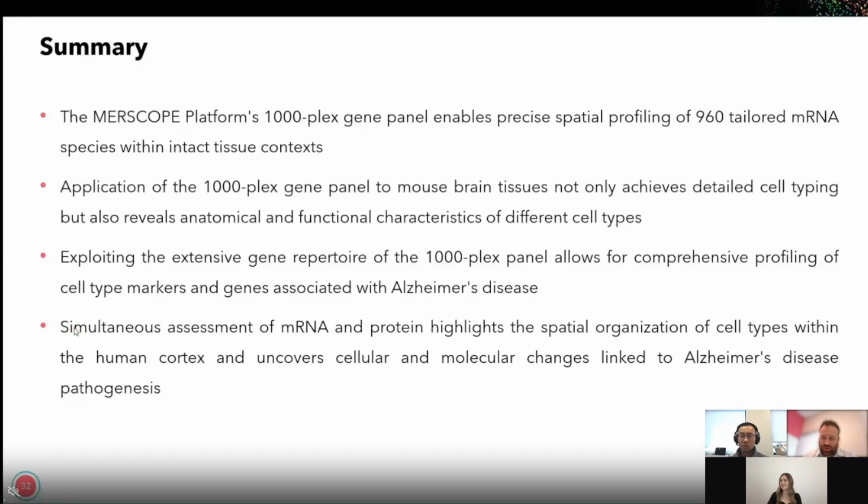Great, thank you, Renchao. And I want to thank our audience for all these great questions coming in here. We do have some more time, so we will continue with a few more. Our next question asks, how many antibodies are available and validated now for co-imaging with 1000 plex RNA Merscope imaging?